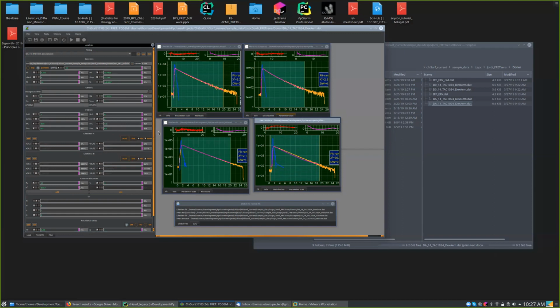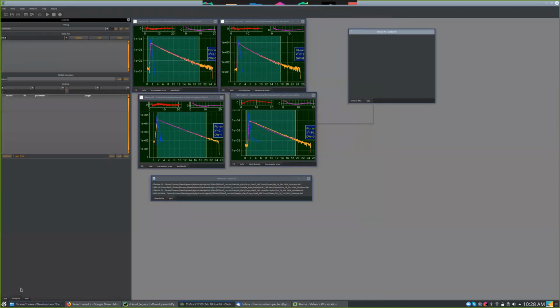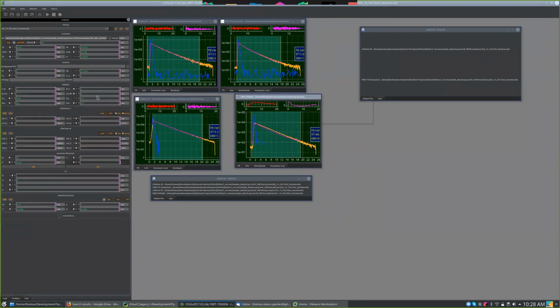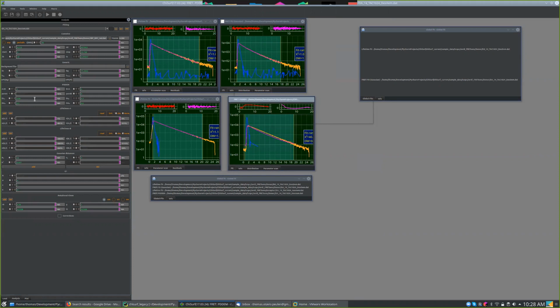So my guess is, so like therefore I said like it's maybe a good idea to do it iteratively. So you can do, if you want to, another global fit where you only fit, let's say, the donor only. I'll make it bigger here, where you only fit the donor only fits. So this and the donor only, just to make sure that they are good. Then here I would fit this again, because this is the acceptor only. Because now what we're left with is kind of like that this fit does not work. And there are, as a start, I would just leave some parameters open. Namely the ones we know the least.